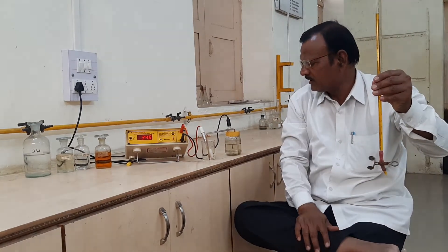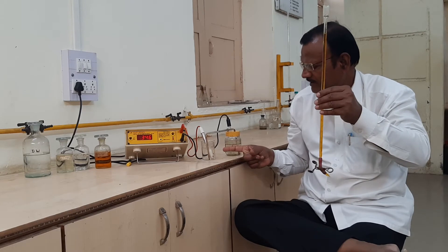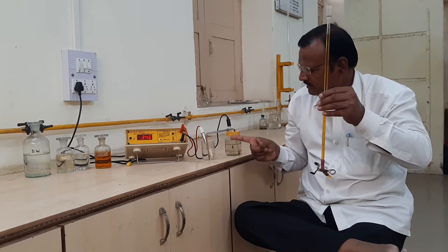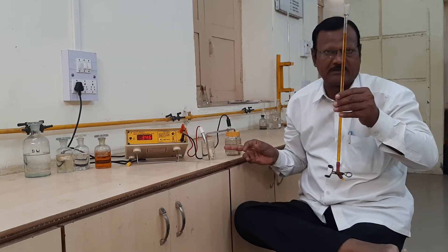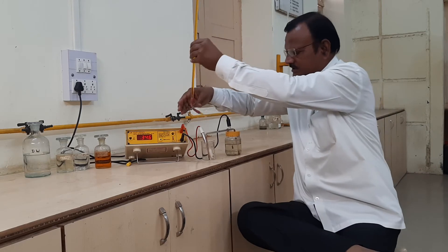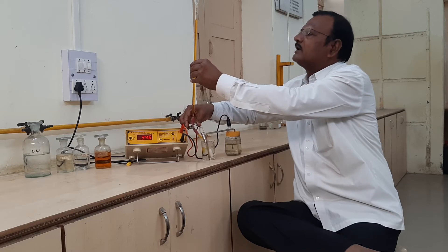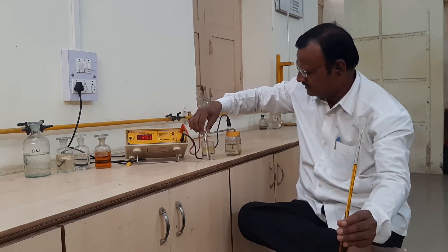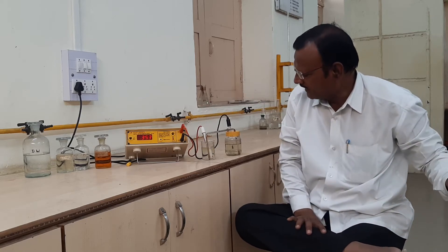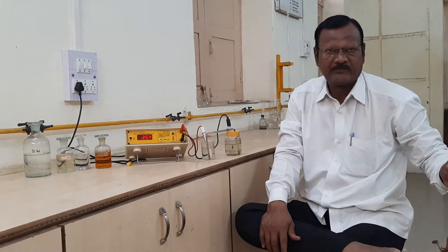We add 1 ml of potassium dichromate solution into the second half cell, which contains 10 ml of ferrous ammonium sulfate and one test tube of sulfuric acid in diluted solution. Then we stir the solution, wait a few seconds, and observe the second reading on the potentiometer.